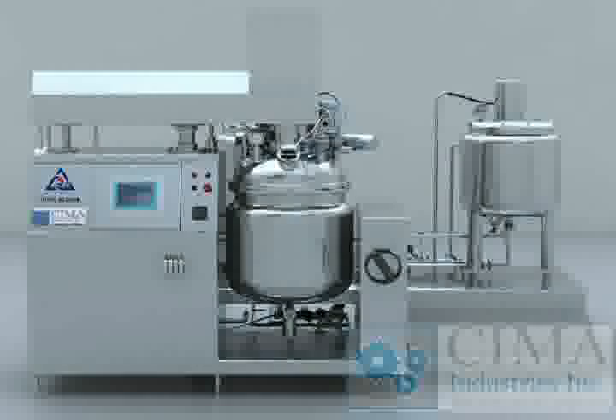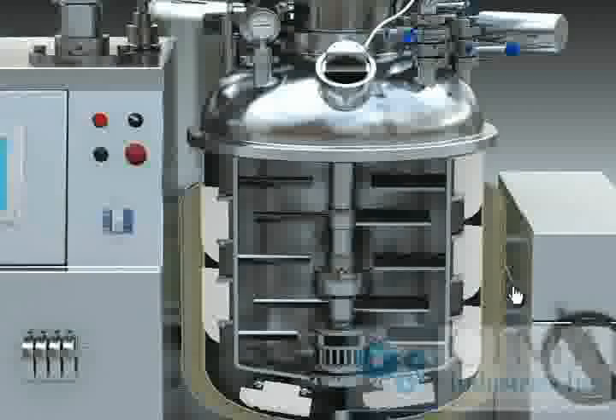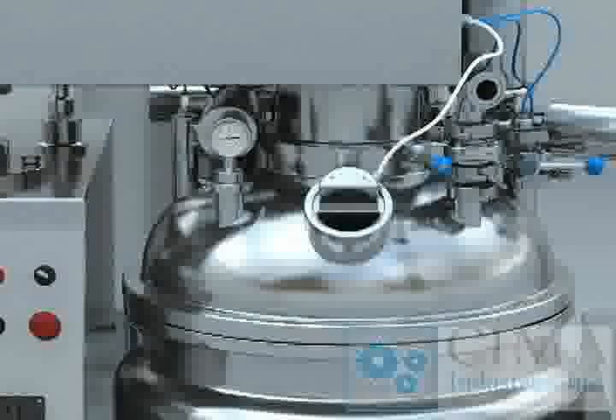The emulsifying mixing tank has a three-layer structure with upper and lower ceiling heads. The lower ceiling head is connected with the tank by flange, and the thermal protective layer adopts PU foam technique. Inside the tank, there is a high-speed emulsifying mixer and a forward and reverse low-speed mixing device. At the bottom of the tank, there are an automatic discharge valve and a temperature sensor.